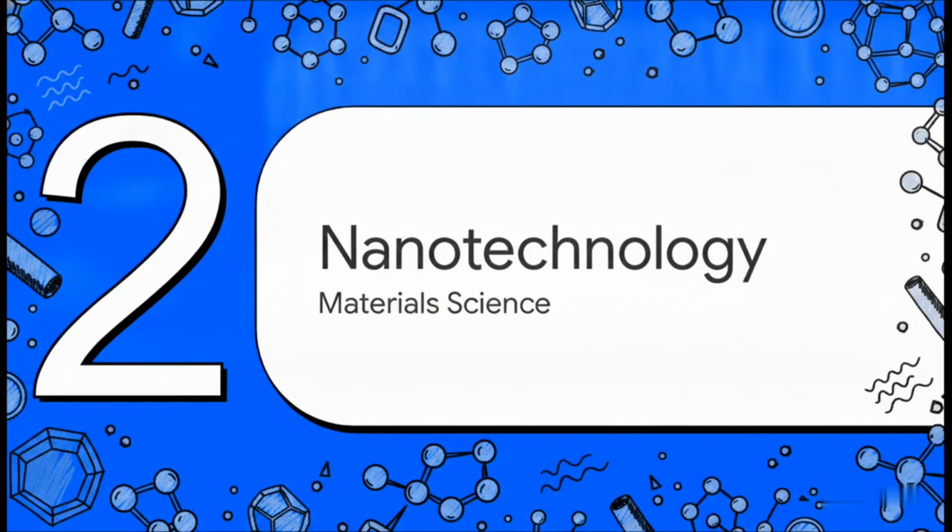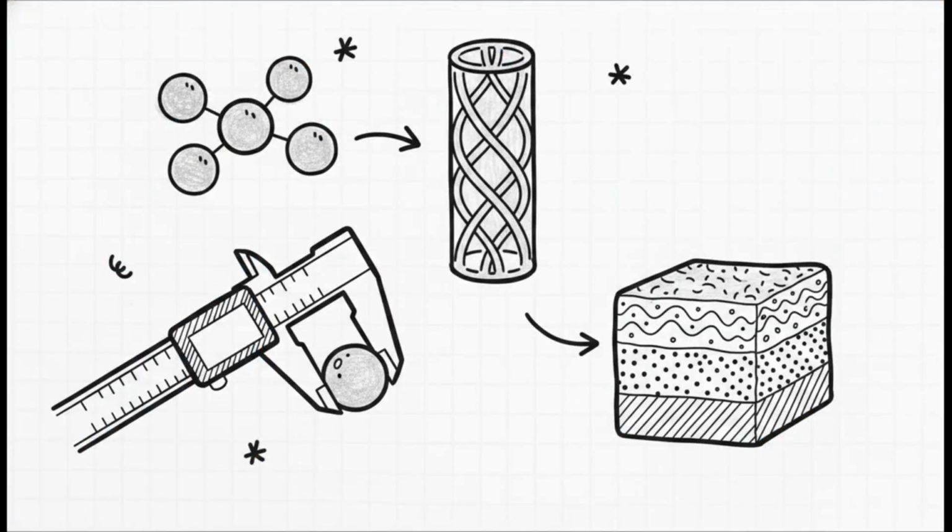Section 2. Nanotechnology and Materials Science. Engineering the micro-world. Now, over in materials science, the FESEM acts as both an incredible camera and an ultra-precise microscopic ruler. Scientists are using it for visualizing complex nanomaterials, things like individual nanoparticles or carbon nanotubes. They use it for directly measuring the dimensions, actively sizing nanoscale features to ensure they were manufactured correctly. It's also vital for studying thin films, so checking the exact thickness of microscopic coatings, and for surface morphology analysis, giving engineers a really up-close look at the texture, porosity, and grain structure of brand-new synthetic materials.